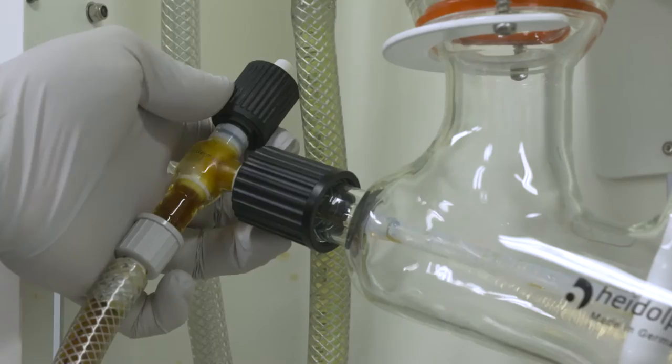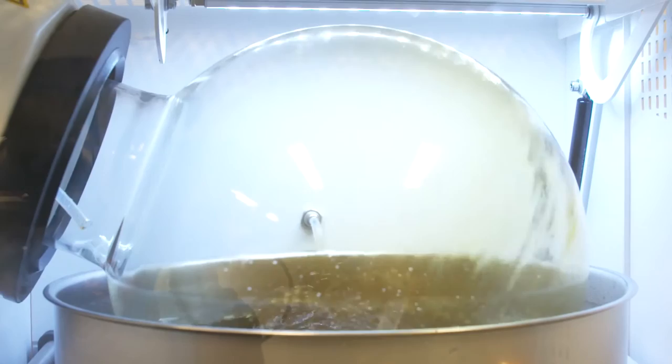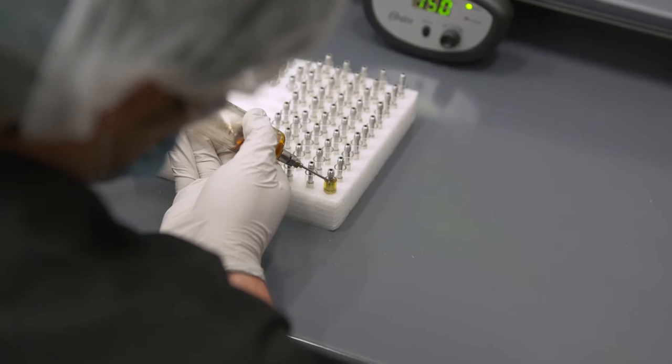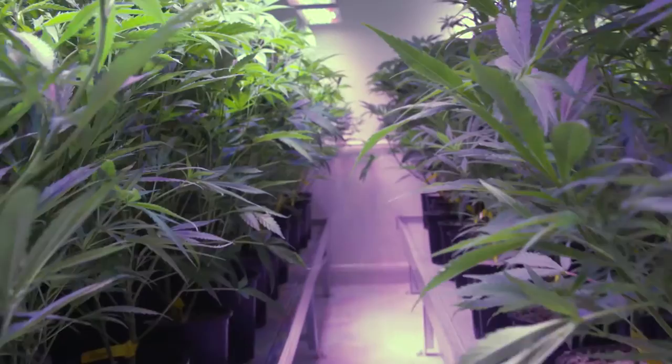While industrialized cannabis extraction is a rapidly expanding new industry, many of the methods used within it trace their roots to botanical extraction applications commonly used in other industries. Botanical extraction methods used in flavors and fragrances — such as the mint found in your toothpaste and ice cream — are made by the very same process of extracting the essential oil from the plant, understanding the chemical makeup of that oil, and formulating it in a proper dose to give the desirable flavor or fragrance. This can be directly applied to the cannabis industry by understanding the proper method to do the extraction and analyze the oil that gets used in a cannabis containment product.